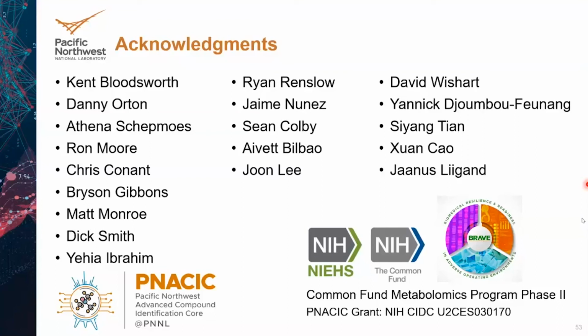Great, thanks, Tom. Next question: how are you planning to validate the in silico CCS database with experimental CCS data? What rationale to select compounds and use those available from efforts of other groups' work with IMS? Mm-hmm. So for the papers that I showed in the CCS section, one was on the in silico quantum chemistry tool, which we call Icicle. The other was on the deep learning tool called DarkChem.